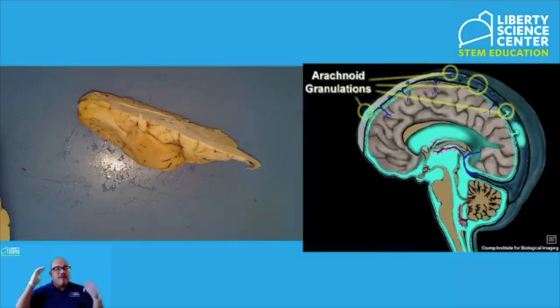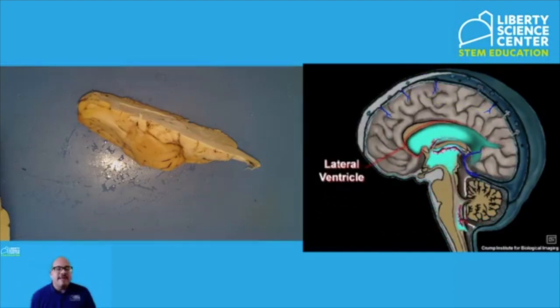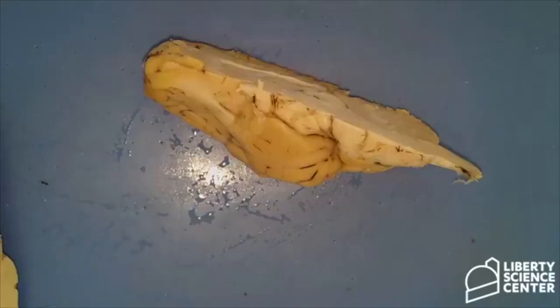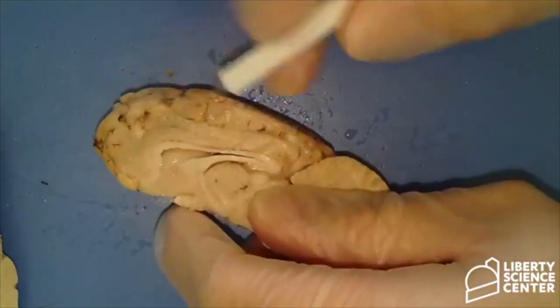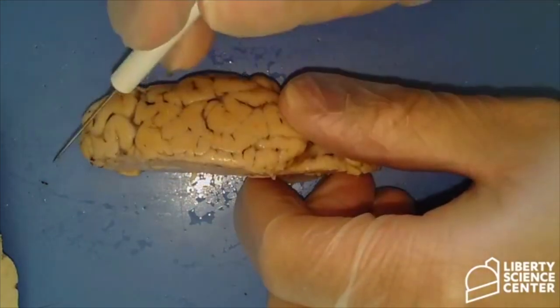So that's why we don't feel that 3-pound weight in our heads, because it flows up there almost weightless. All right, excellent. So let's go back to our sagittal cut. This is the cut that we are looking at. When we make that dissection along the fissure, that means it's a sagittal cut. It goes vertically.